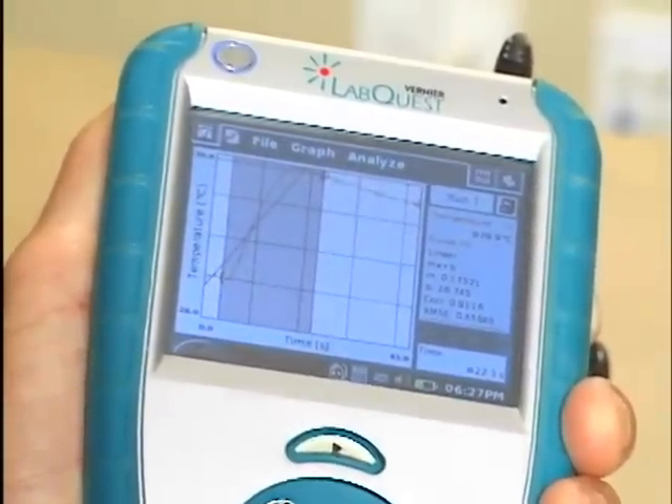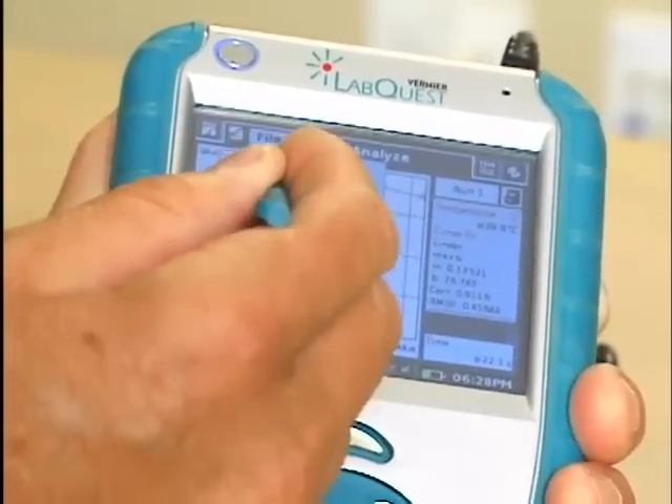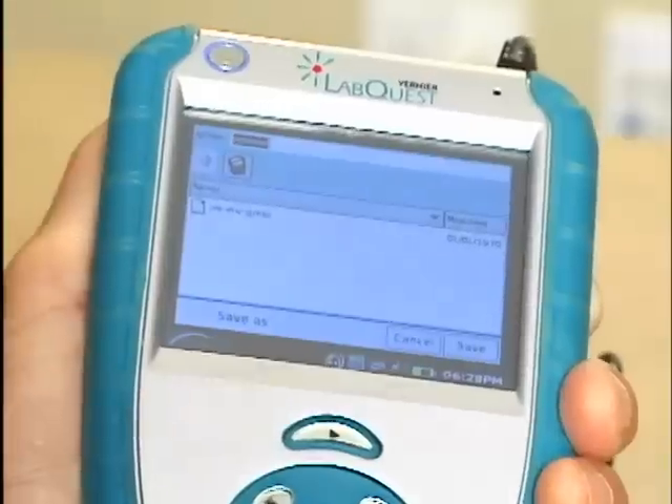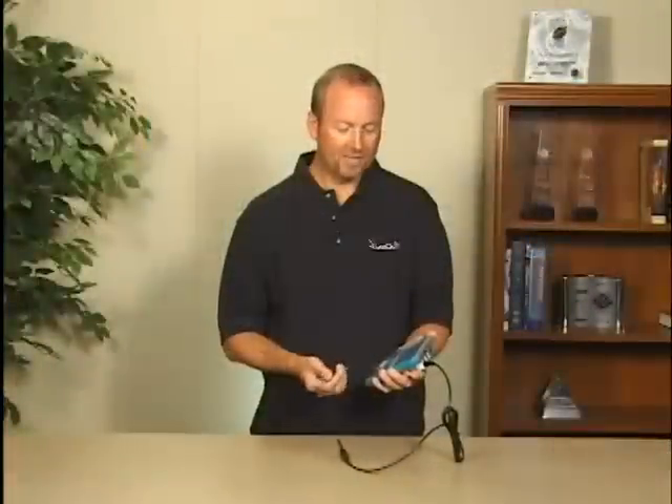Your data can be saved on the device, saved out to a memory card, or transferred up to the computer. It's very easy to use and very easy to get started. That's just a brief overview of the application — more detailed information can be found at our website or in the quick start guide found in your box.